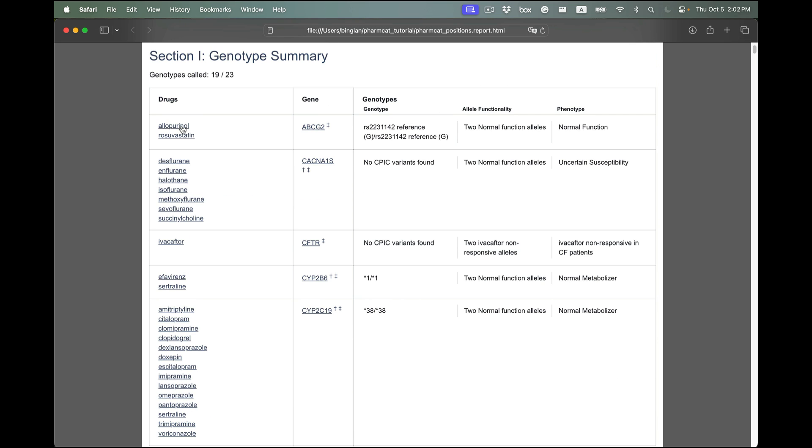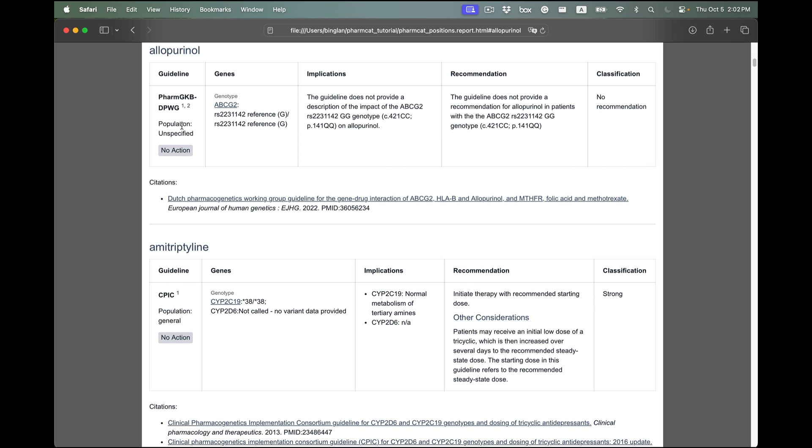If you click on any drug, it will directly take you to the drug prescribing recommendations section, where it shows you all of the genotype-based drug prescribing recommendations from different sources with links and citations.